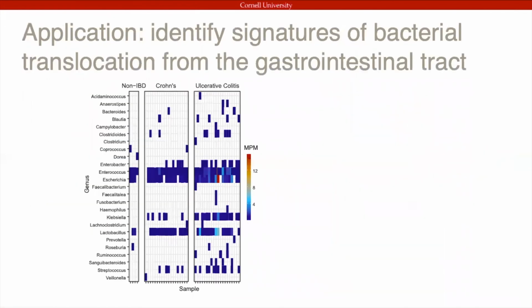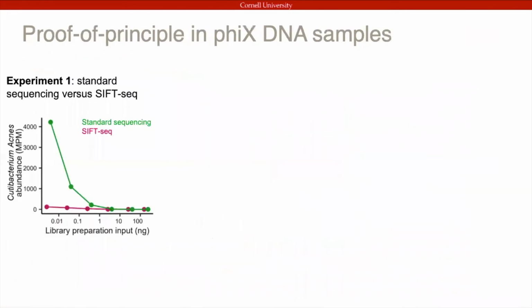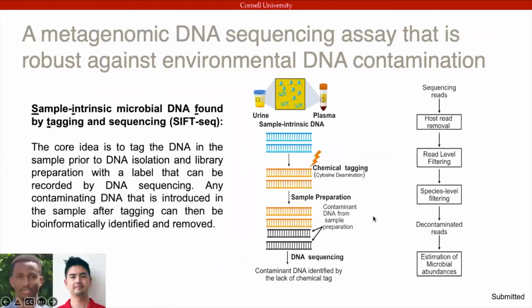For bisulfite treatment in particular, we can look here. And again, we have host read removal as the first step. After that, we want to look at the read level. And so for cfDNA in particular, we're really concerned with the conversion of molecules because this indicates both how well our conversion worked, as well as if we're able to identify if it's a contaminant.